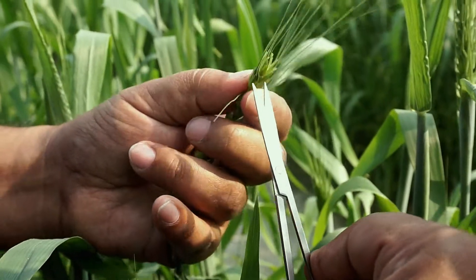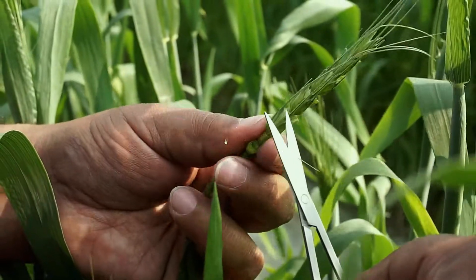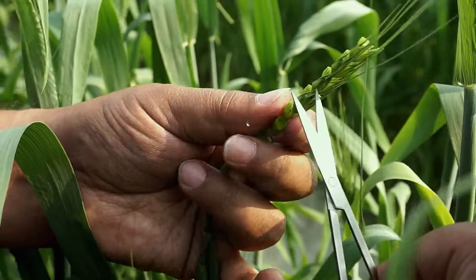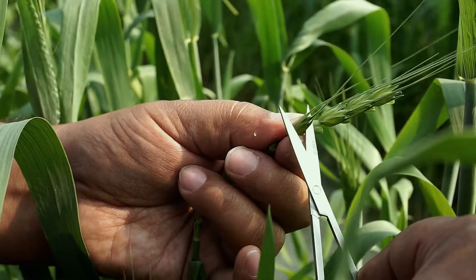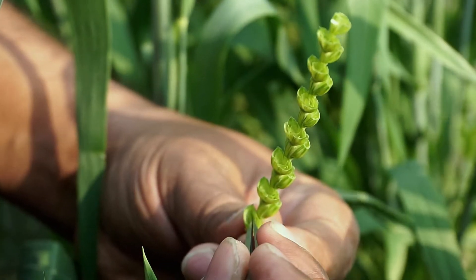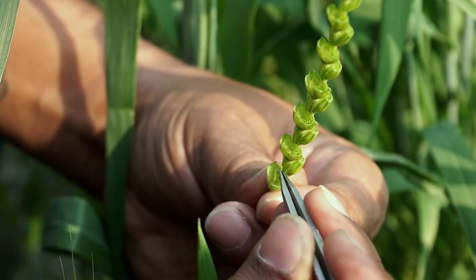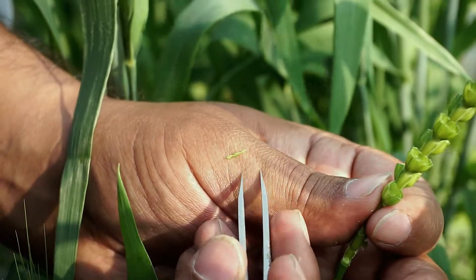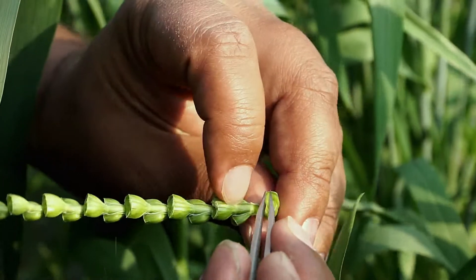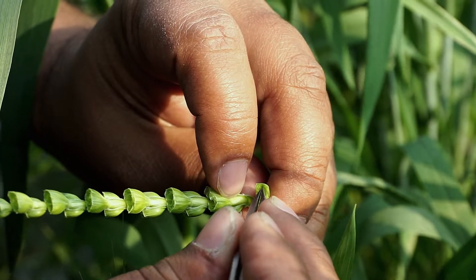It should be noted that during emasculation, cutting of the spikelet should be very careful — it should not damage the ovary and shall give substantial space for pollen shedding. After cutting the spikelet, all three anthers should be plucked with the help of forceps, and no anther shall stay behind as it will lead to self-pollination and failure of hybridization. Additionally, anthers should not break while plucking, as this will lead to bursting of pollens on the ovary and therefore lead to self-fertilization.